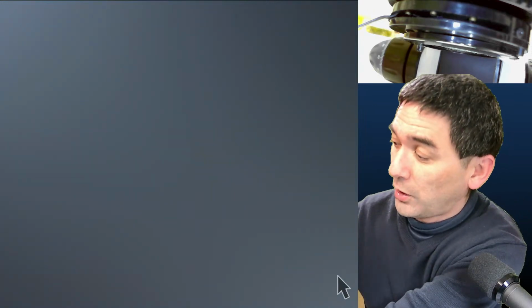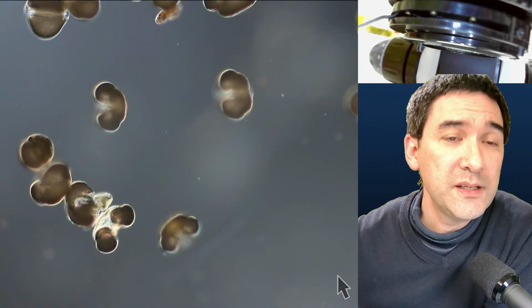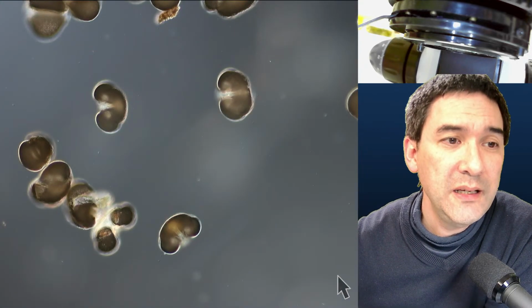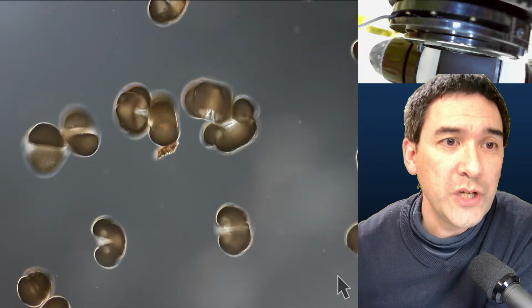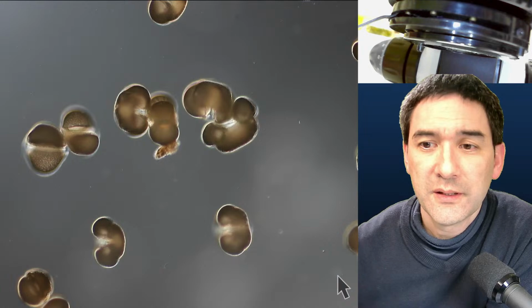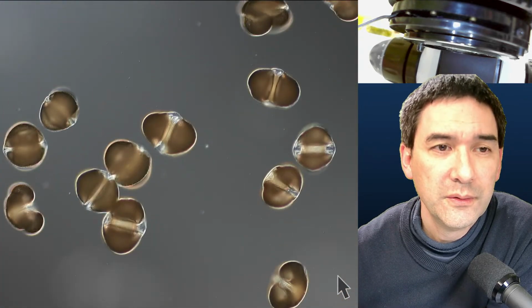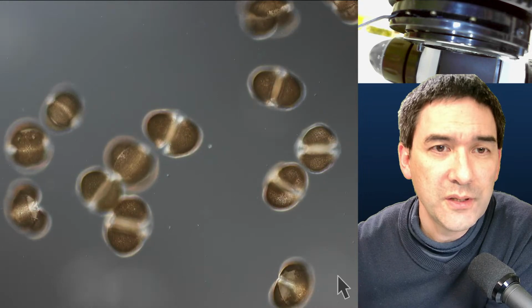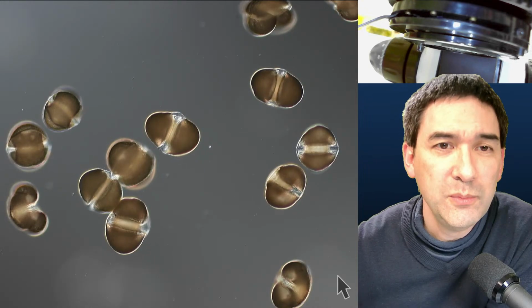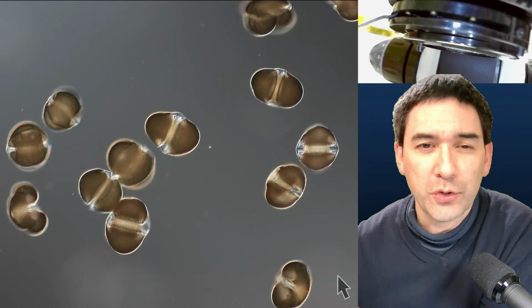Next one is now the PVA glue. Again, this here is water-based. And look at this. Here we have also maintained the original shape quite well. That's the PVA glue. You see also that they seem to be a little bit larger, because I think if you use the other mounting media, they start to shrink a little bit.